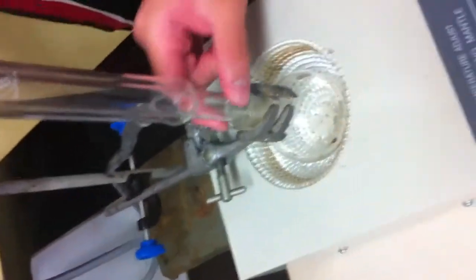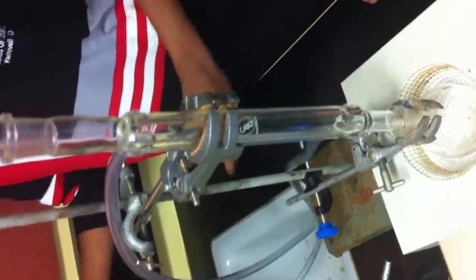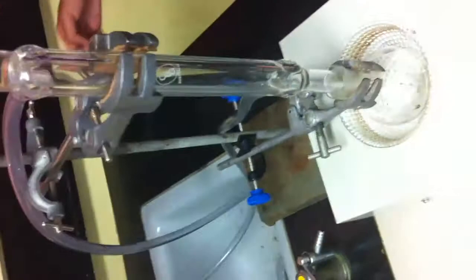We should put grease. Nah, it's good enough. Okay, what now? We already used silicon. We've used the condenser before. We haven't even started it. It takes like 2 seconds, she said. What's the voltage? I think it's good enough. Is it hot or not? It's not even on yet. Turn it on. Okay, so good. And now we're going to turn on the heating mantle.